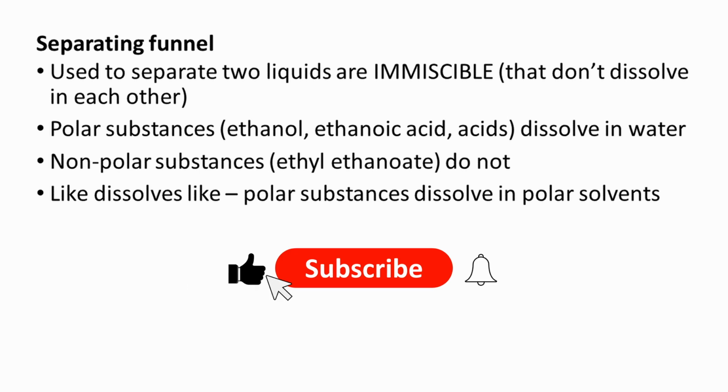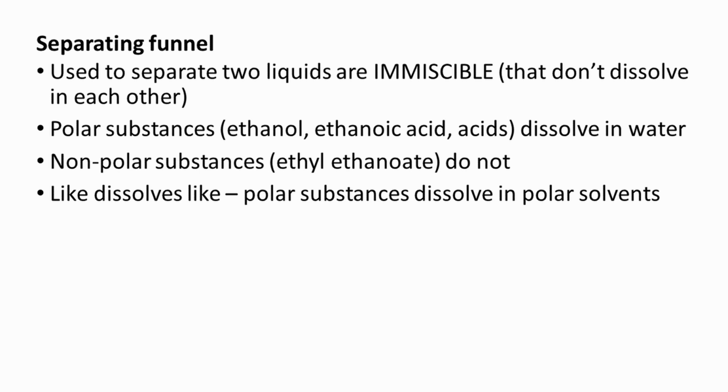Polar substances, ethanol, ethanoic acid and sulfuric acid in this case, dissolve in water. Non-polar substances, ethyl ethanoate, do not. We often use the phrase like dissolves like. This means that polar substances dissolve in polar solvents.